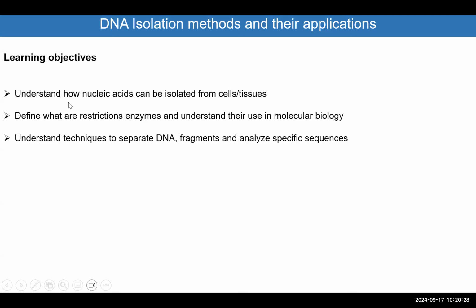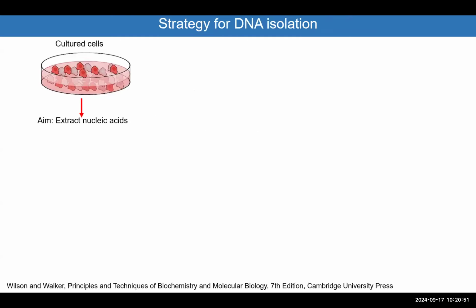So I will mostly focus in this lecture on nucleic acid isolation. In the next couple of lectures, I will cover the restriction enzymes and the techniques that we use to separate the DNA on a gel or for sequencing and for some downstream applications. Okay, so if you come to a lab and you are performing an experiment, you have to first look for the strategy that you need to follow.